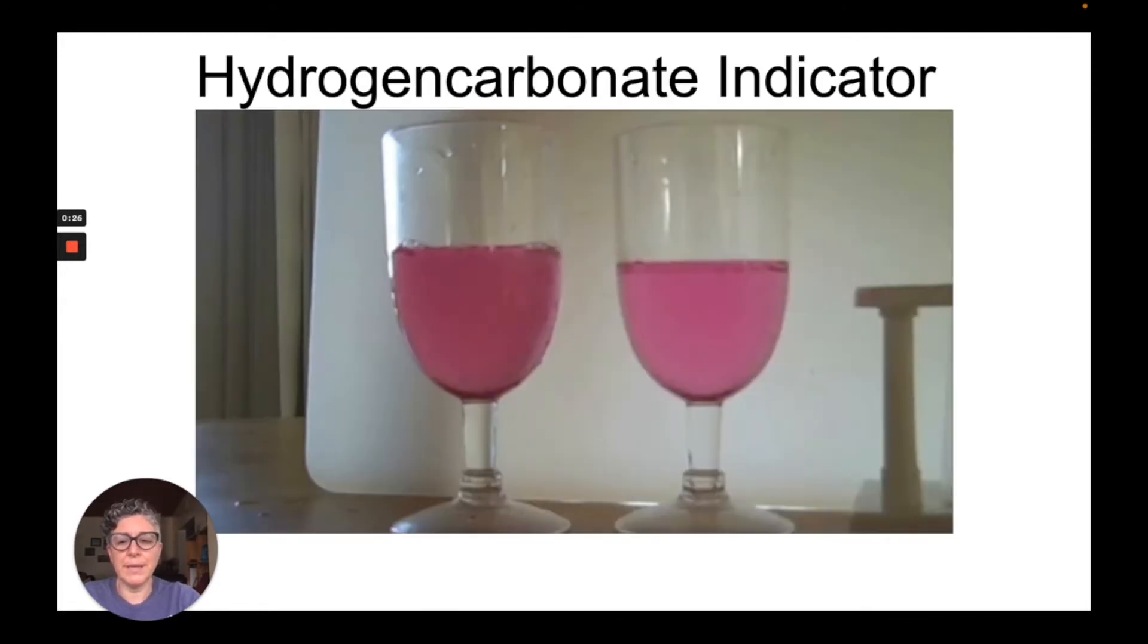Before we get started with the actual experiment, we're going to take a look at what happens with the indicator that we use with this experiment. The indicator we use is called hydrogen carbonate indicator and under normal conditions it has this pinkish almost orangey color.